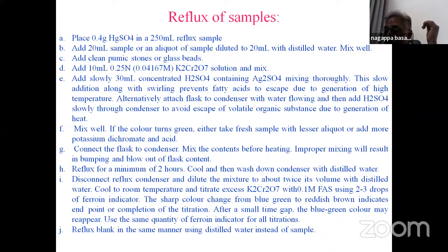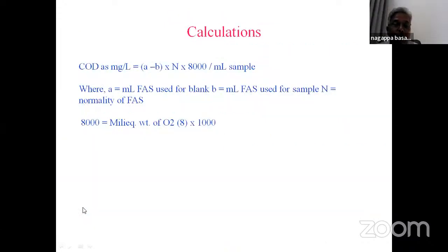Reflux it on the aluminum refluxing chamber. After 2 hours of reflux, all organic matter is digested. Then remove the reflux flask, cool to room temperature, and titrate against standard ferrous ammonium sulfate with ferroin indicator. Note the burette reading.